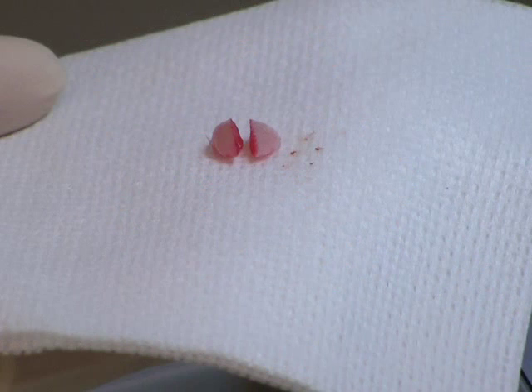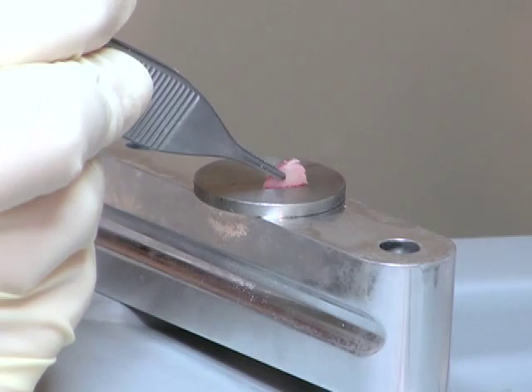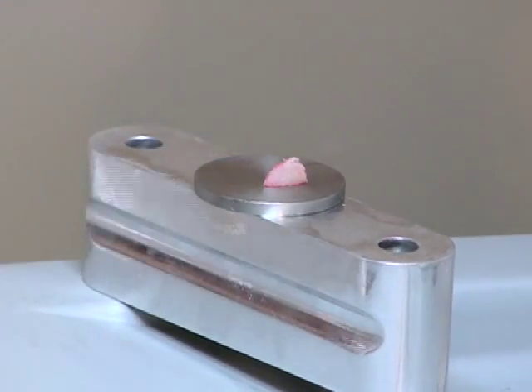When vertical biopsies are needed, the moist tissue will stick to the cold disc and stay in place during the embedding process, providing a true cross section of the specimen.